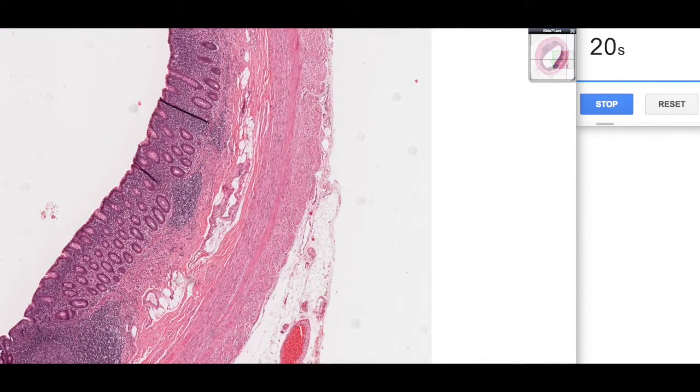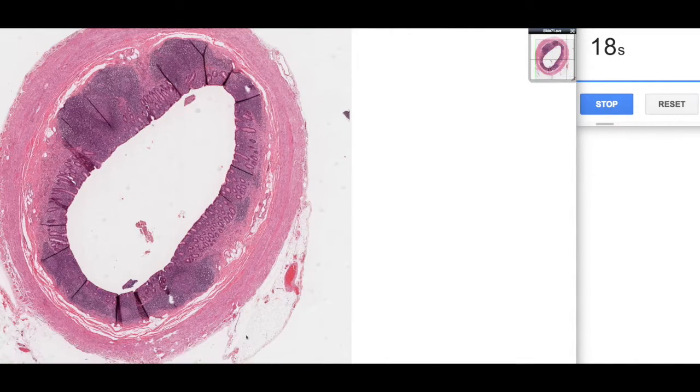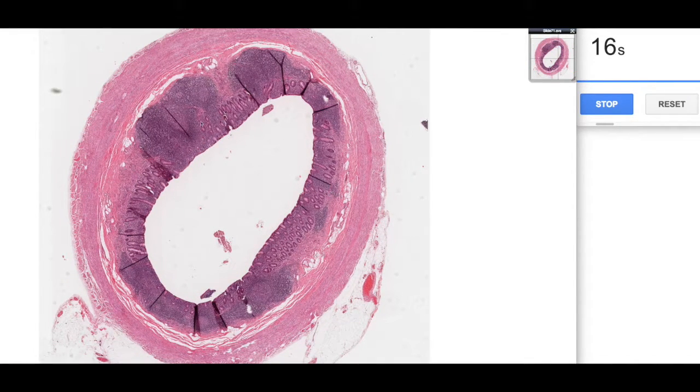So those are the major take-home features of the appendix. Very characteristic basophilic mucosa-associated lymphoid tissue. When you do see the mucosa, it looks like the large intestine. So these are permanent aggregations within the gastrointestinal tract. I hope you found that useful.